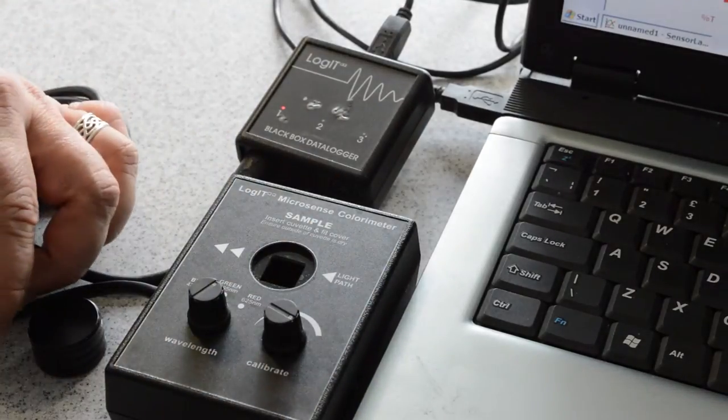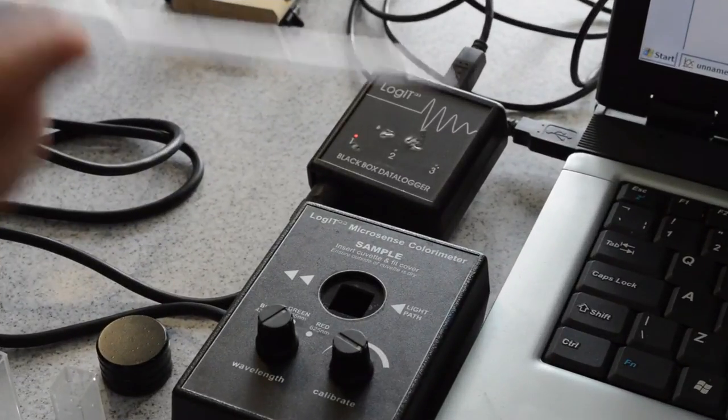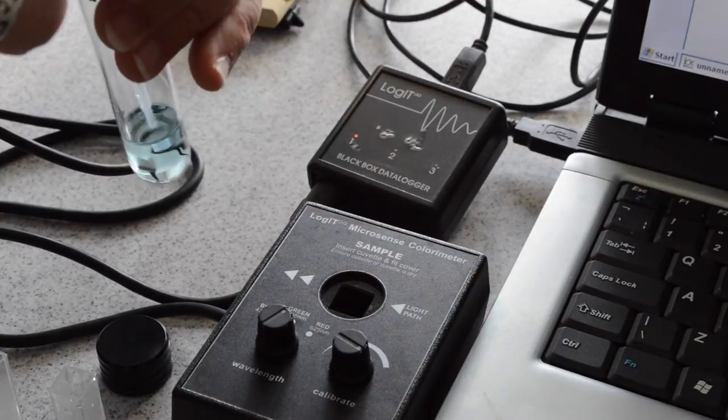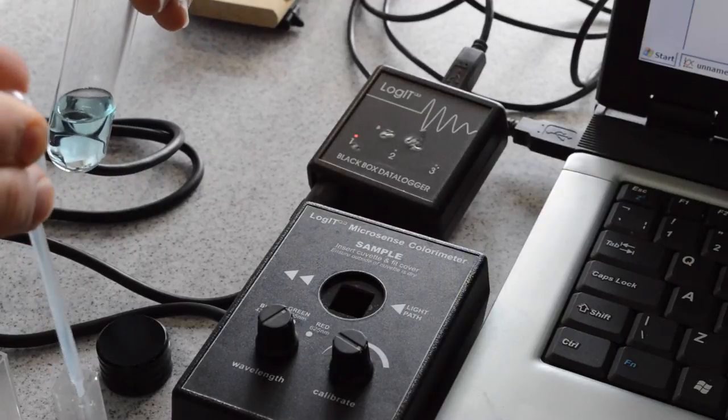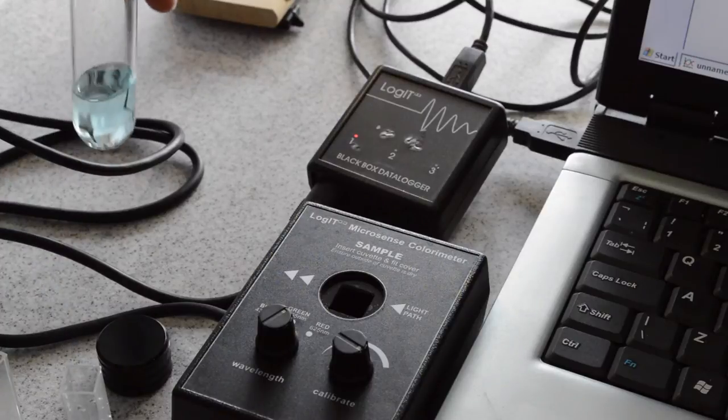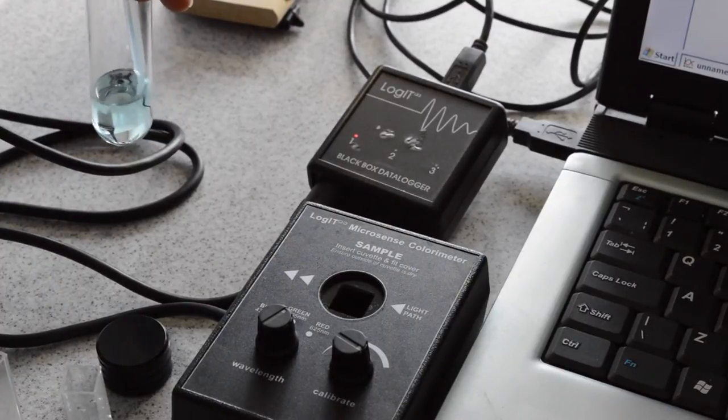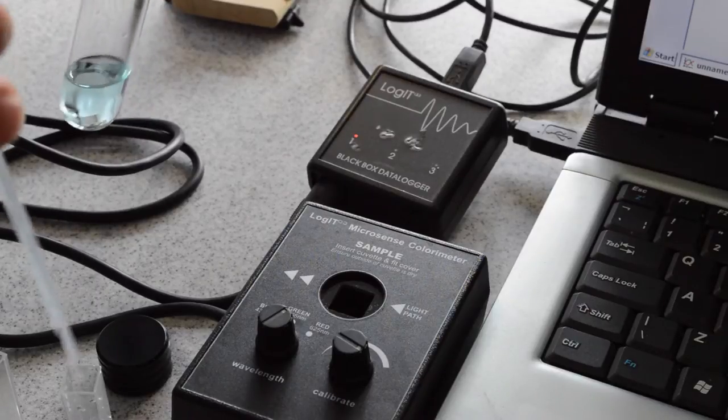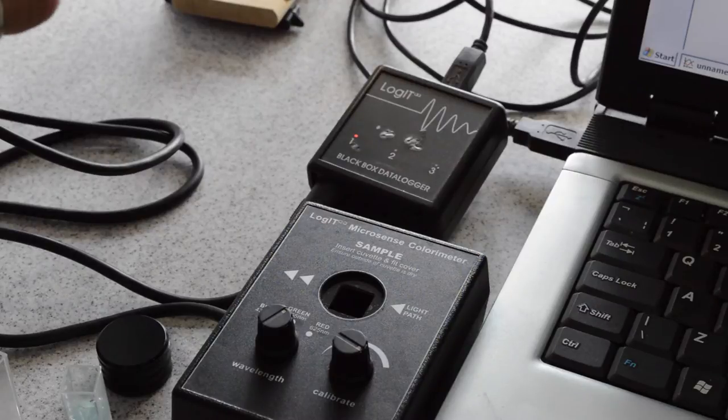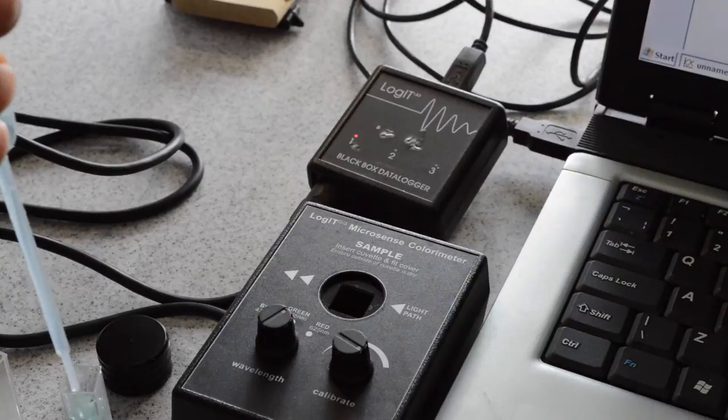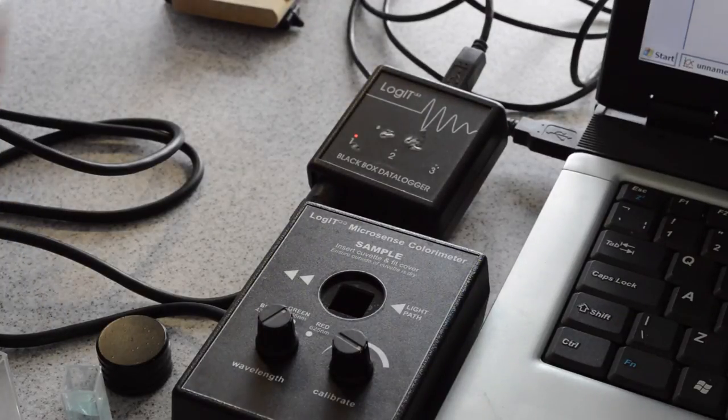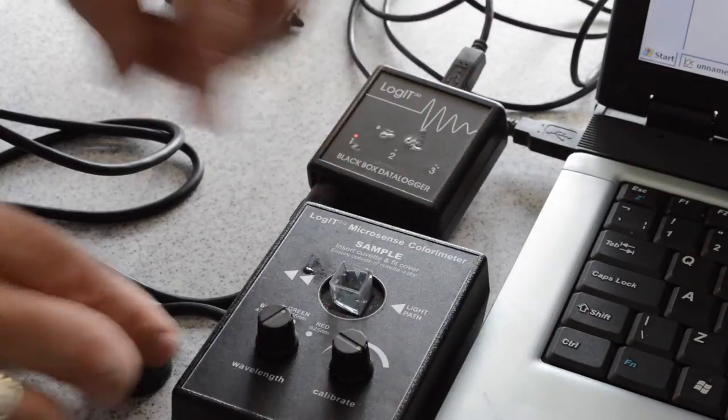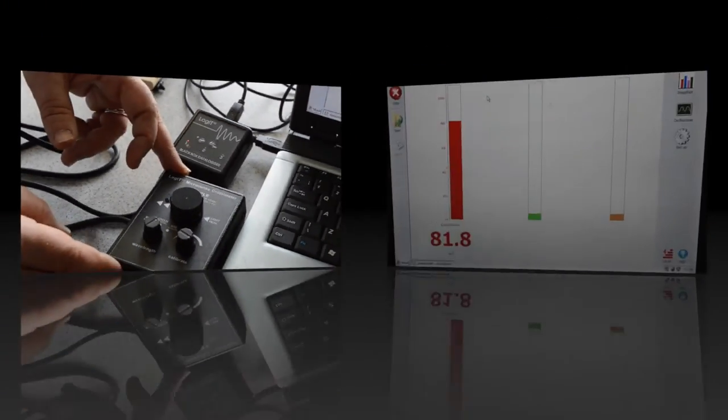When the colorimeter has been calibrated, remove the sample of distilled water. Then using a pipette, fill a cuvette from the sample tube labeled number nine. There is no need to recalibrate the colorimeter to introduce this sample, as the colorimeter has already been calibrated for clear distilled water. Place in the sample from tube number nine and note the value on the colorimeter on the computer screen.